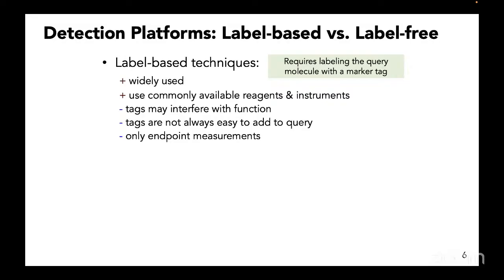These are very commonly utilized. But if you think about it, we are looking at biological function, and if we add some tag or some reagent along with the protein, it is going to mask the functional property. So adding tags is not always a very good way of studying protein-protein interaction or protein biomolecular interaction properties. Also, protein microarrays are a very laborious experiment.